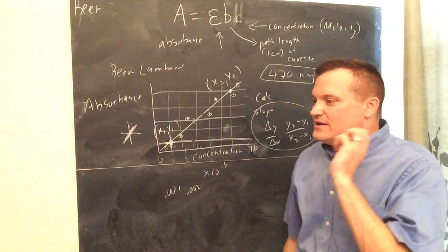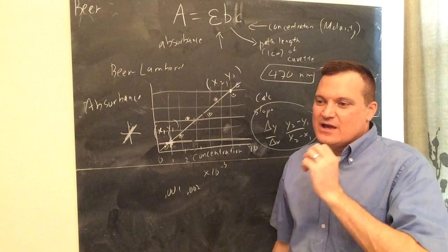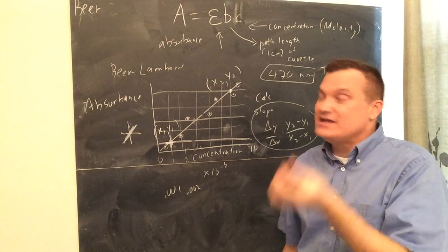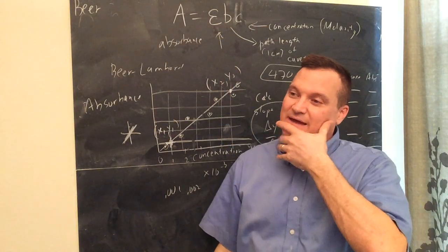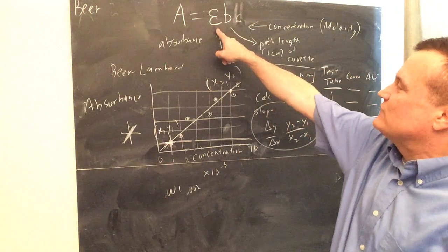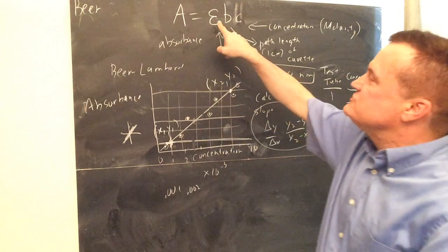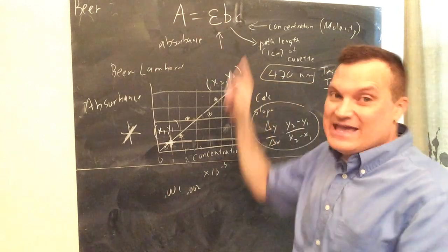So every lab will have its own value for that. Well, actually, depending on the color of the solution, it will have its own value. And actually, if we did an experiment, for this particular experiment, they could all be a little bit different because you're altering the color a little bit. They might all have a different constant, but you find the molar absorptivity constant. Once you know this constant, now you can make calculations with A, B, C.